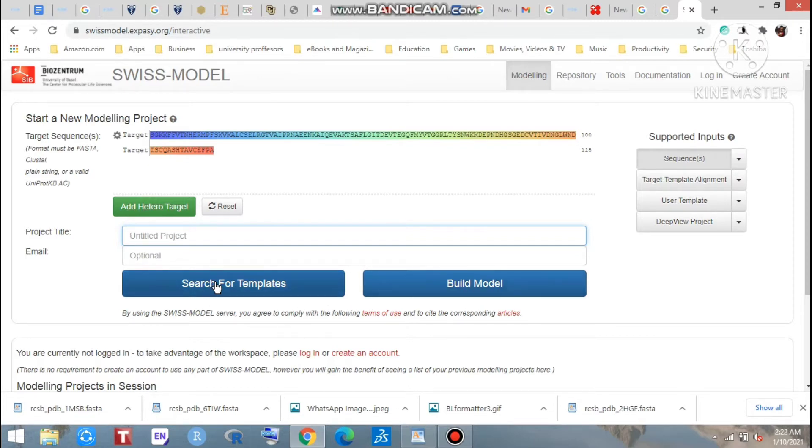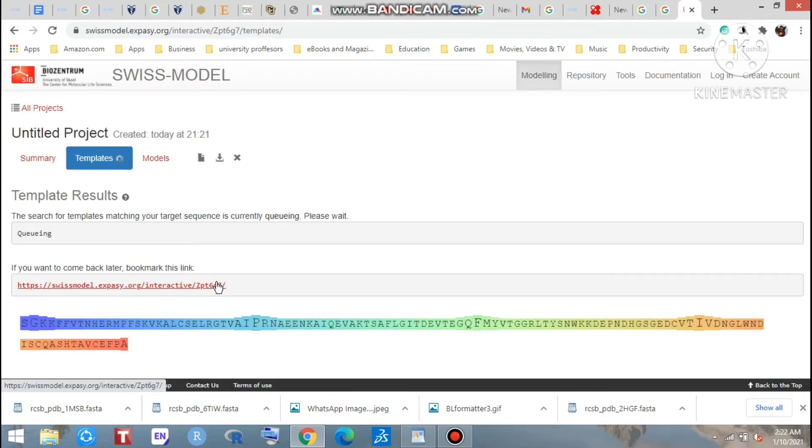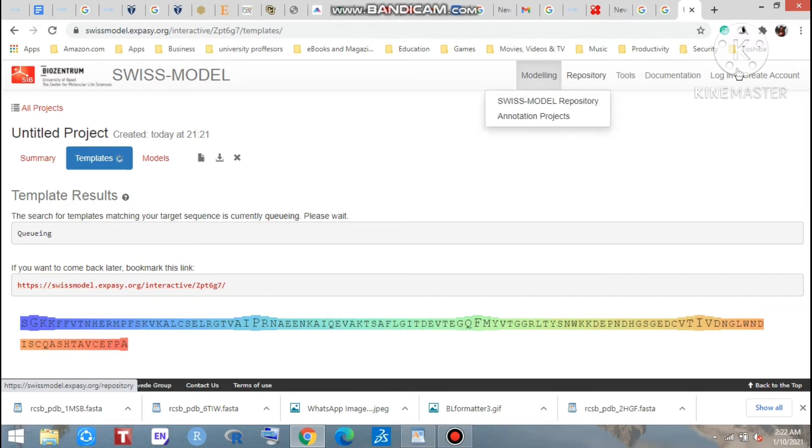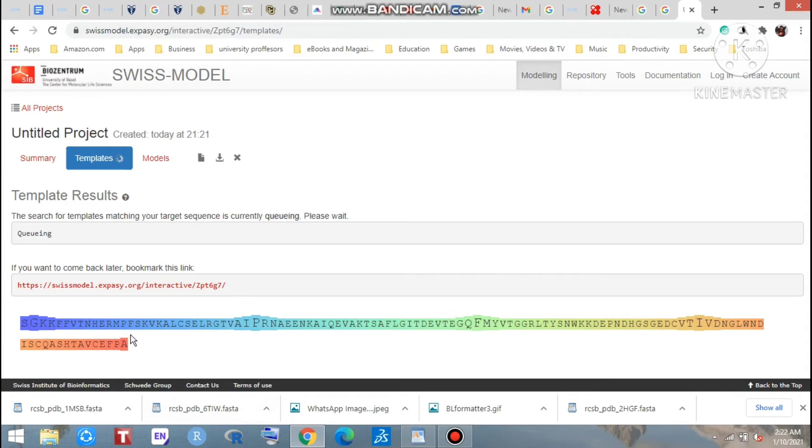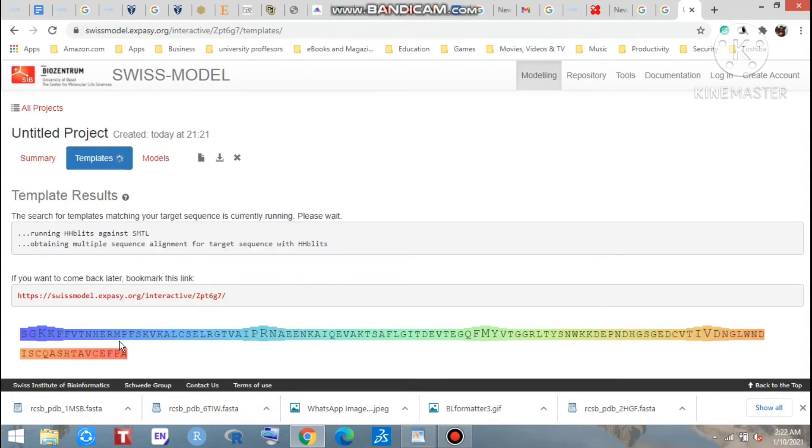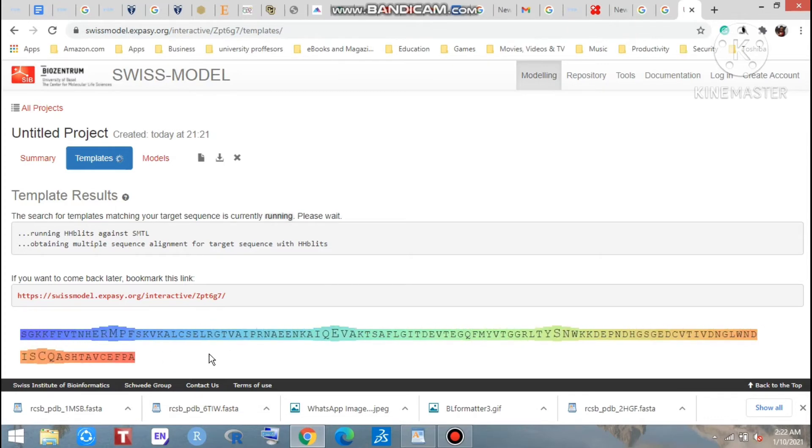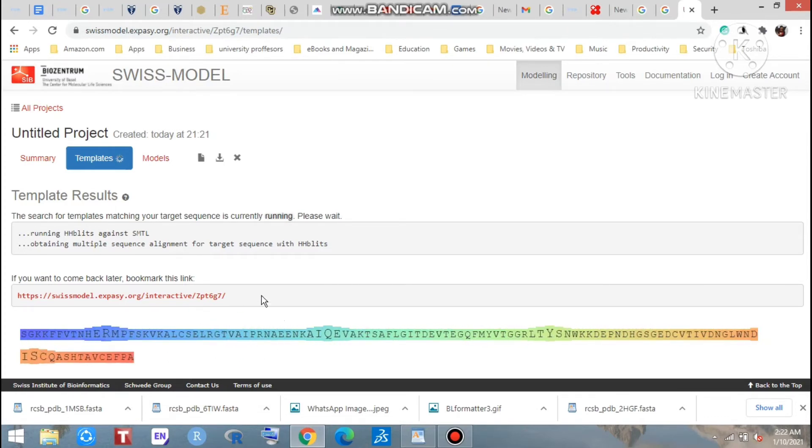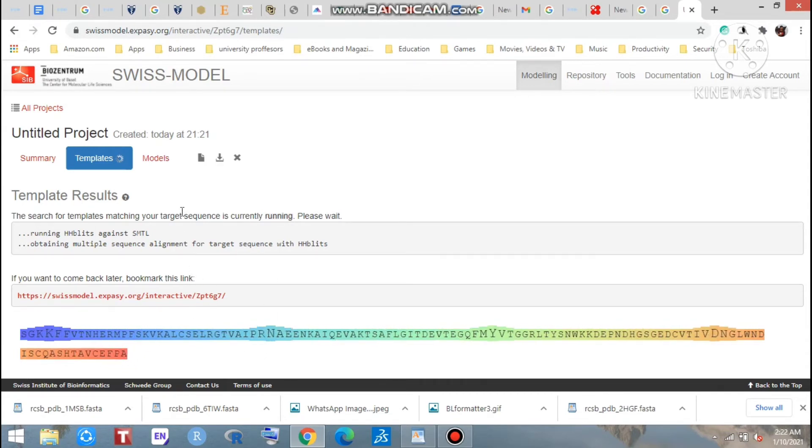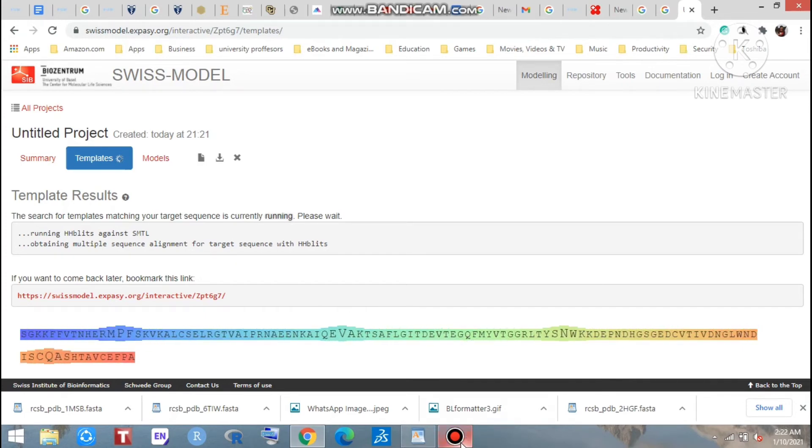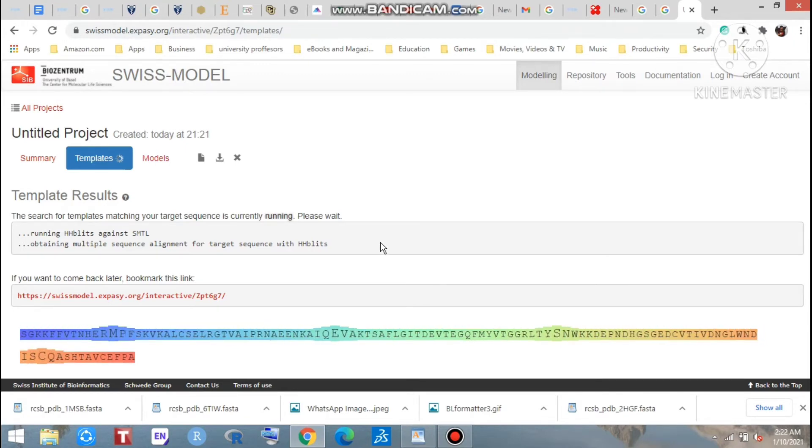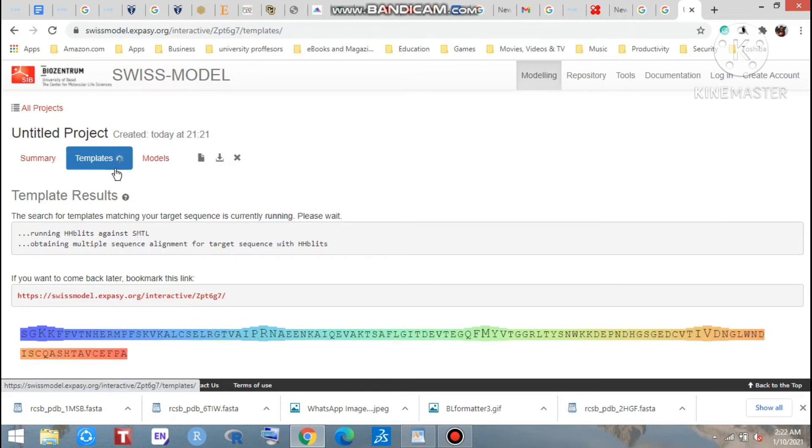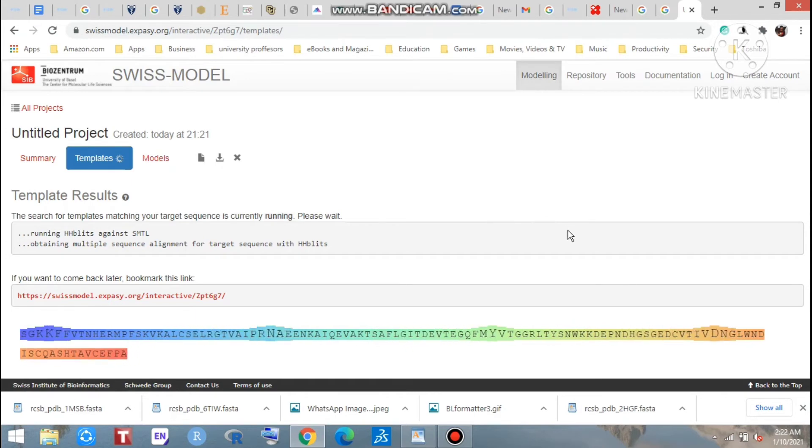Look at that, the templates is analyzing here, and that is called our unknown sequence of the protein. After waiting for some minute, maybe we will get so many templates here. I said to go through this template process, not to go through the model building process.